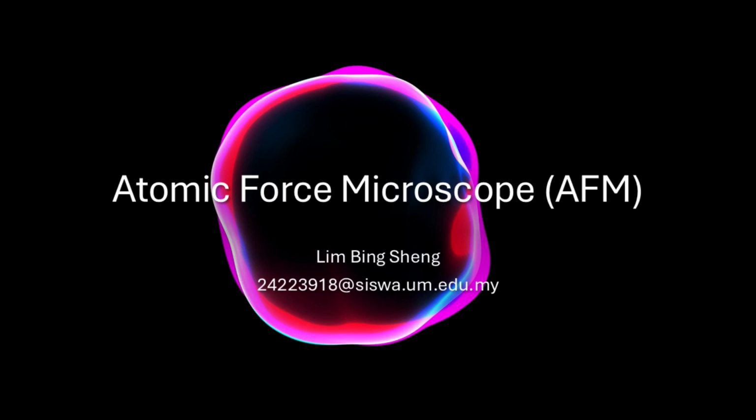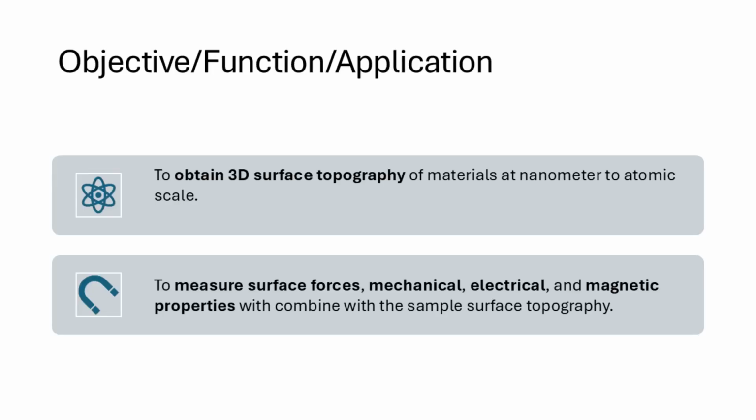I'm going to present AFM, which is Atomic Force Microscope. The objective is to obtain 3D surface topography of materials at nanometer to atomic scale. And second, to measure surface forces, mechanical, electrical, and magnetic properties combined with the sample surface topography.